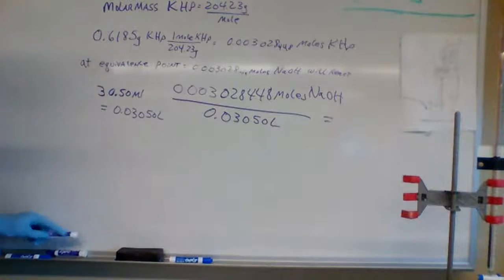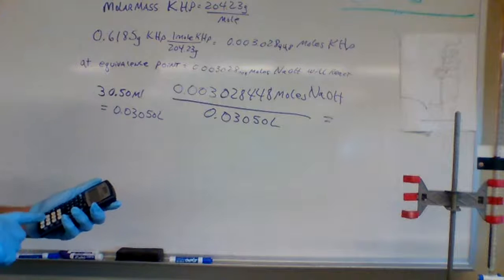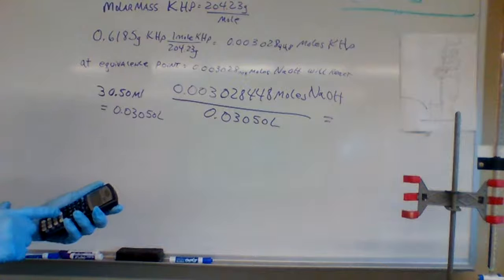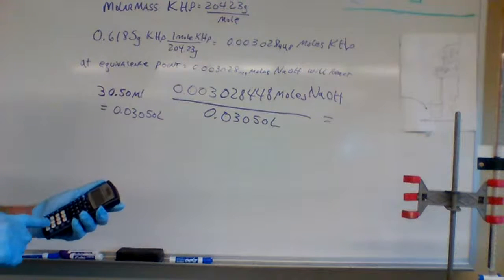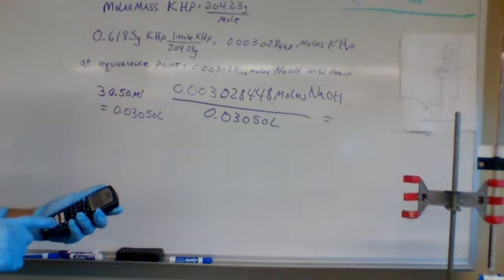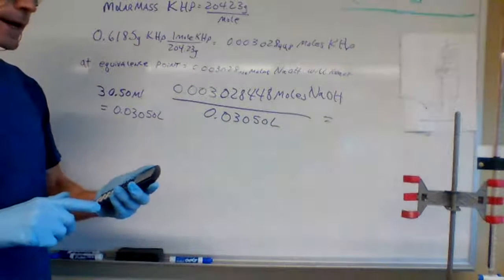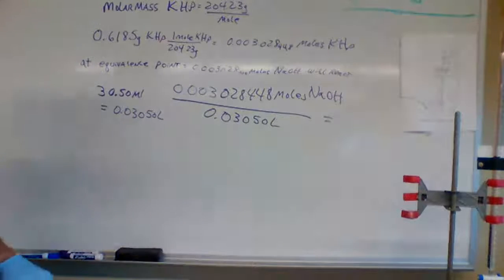Let's calculate precisely what the concentration is. I got 0.09929.